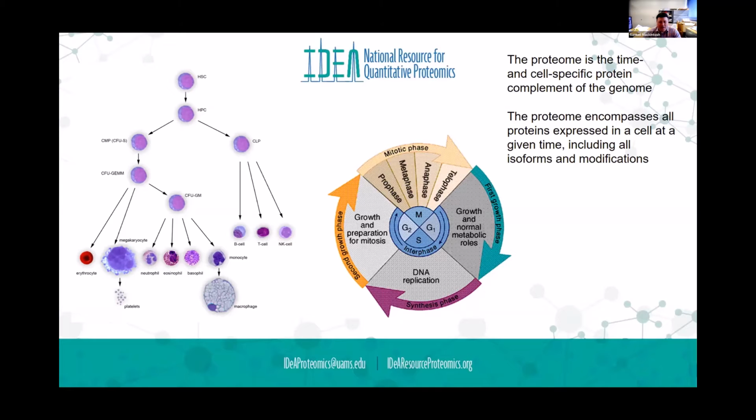So that's one of the sources of a lot of the major challenges that we have to deal with in proteomics, and why a lot of times trying to use mass spectrometry to do proteomics is more complicated and can be more challenging than using gene arrays to measure gene expression directly.